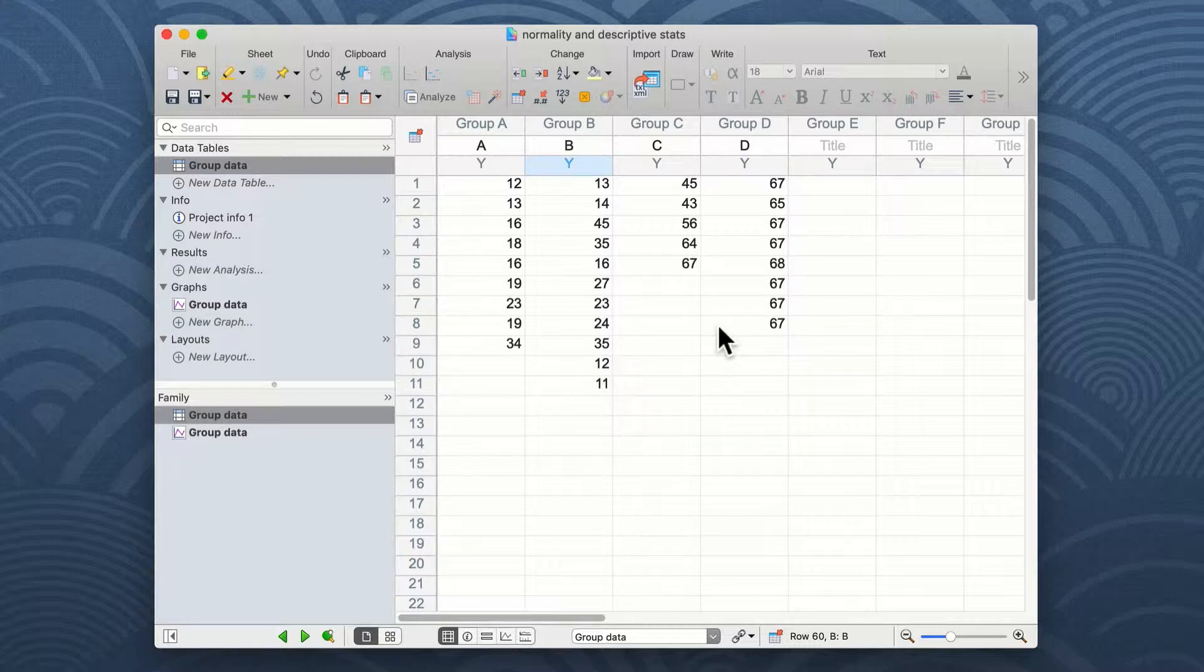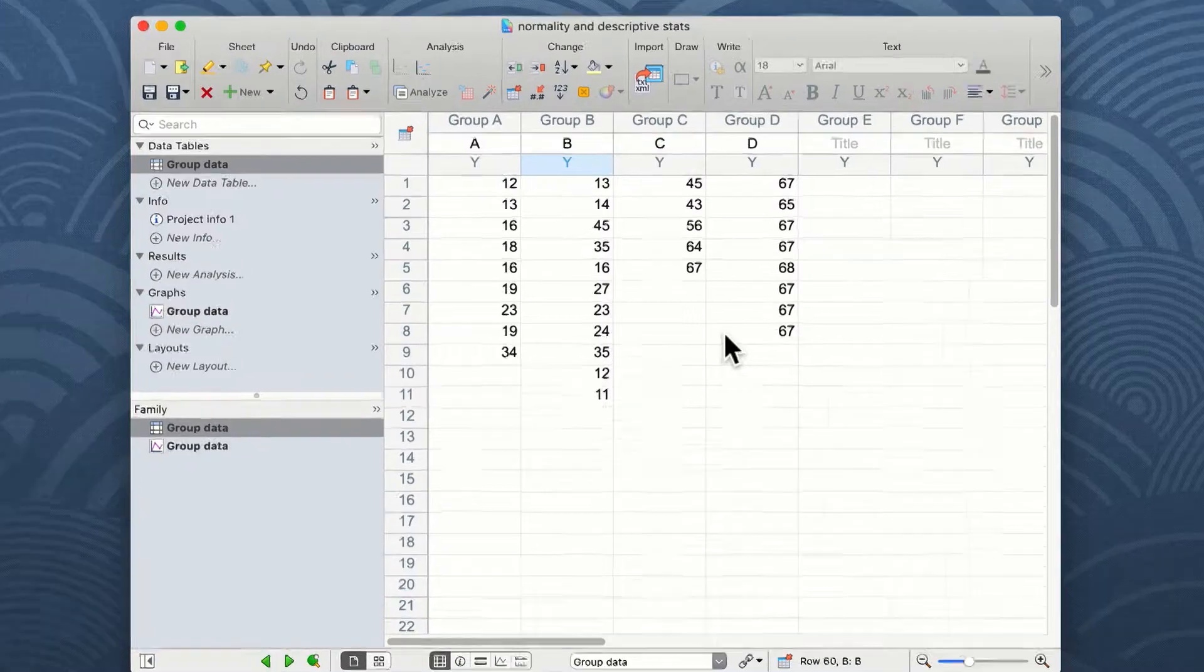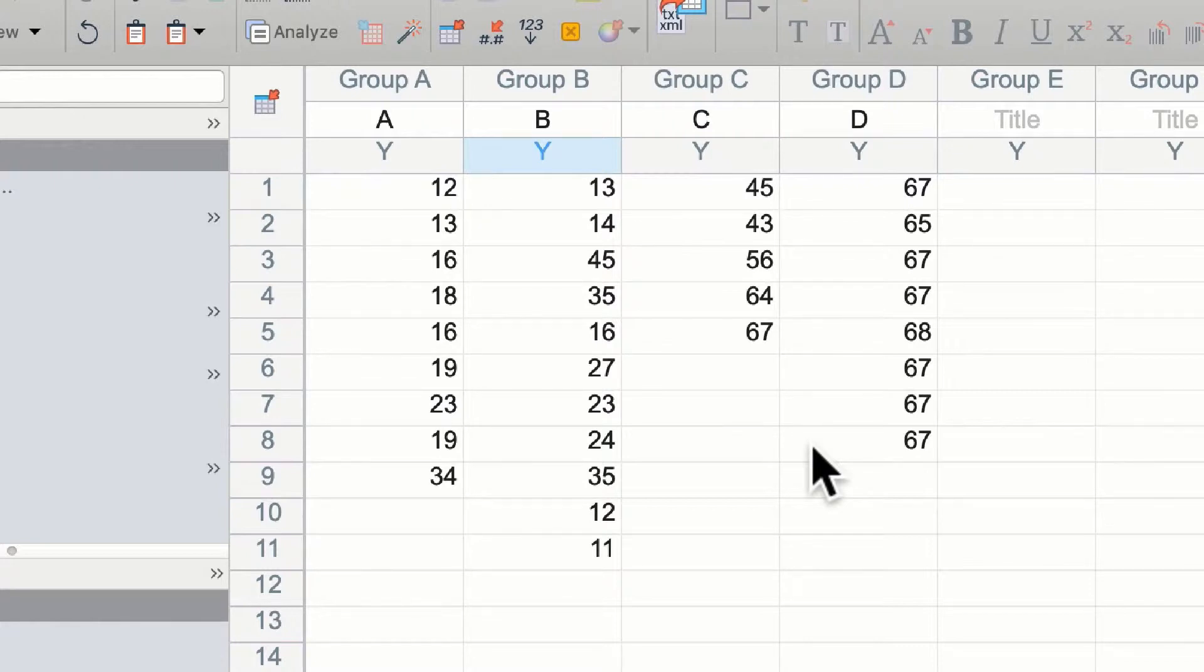On the screen you can see the results of four experimental outcomes. You can see data for groups A, B, C, and D, which have different n numbers in each group and clearly a different numerical outcome in terms of the data set.